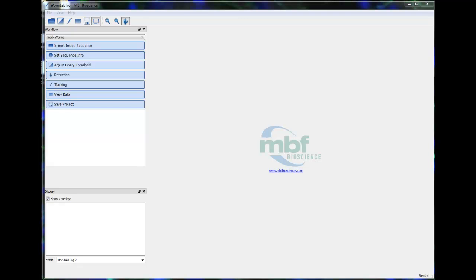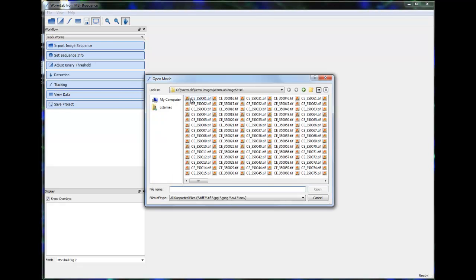Welcome to the WormLab Detect and Track overview. This software has the capabilities to detect and track worms as well as provide our users with analysis data that can easily be exported to Microsoft Excel or MATLAB. Now let us get into what the program can do.